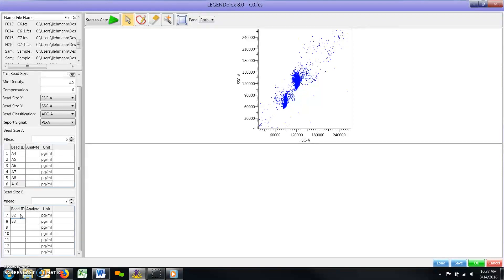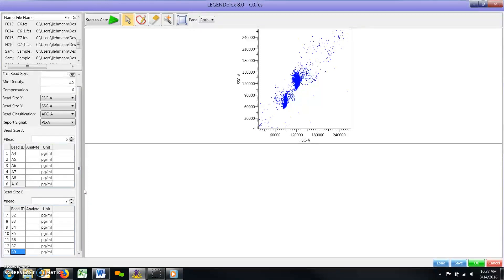Note, if you plan on running the same LegendPlex assay in the future, you may want to save a gate protocol file. This file can be loaded during future analyses and will automatically load all the assay parameters and bead IDs you have just defined.